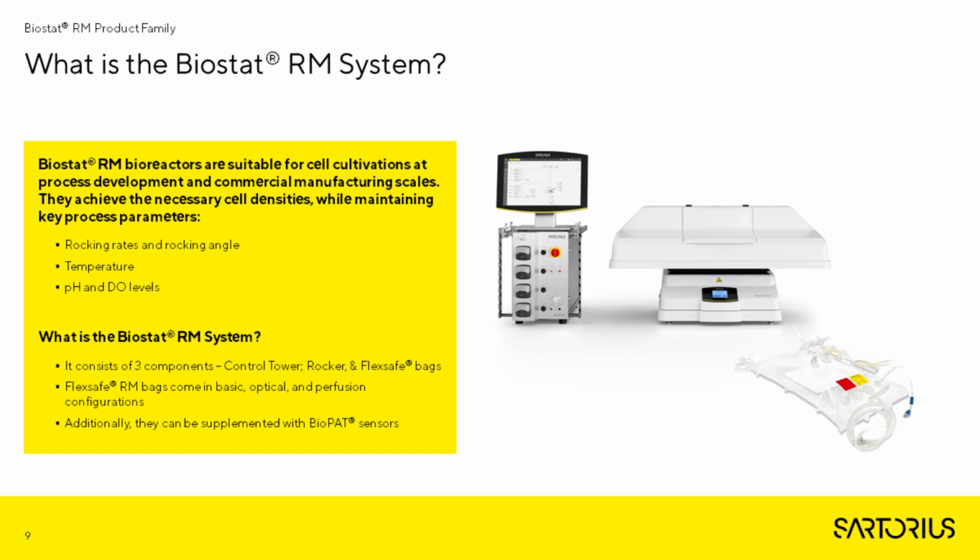So what is the BioStat-RM system? It consists of 3 different components. The FlexSafe bags, that's the bag where the cells are stored and cultured with cell culture media. The FlexSafe bag with the medium and the cells is placed onto the rocker platform. The rocker platform can control the speed of rocking and the rocking angle. It is temperature controlled, so for example, your cells always grow at 37 degrees.